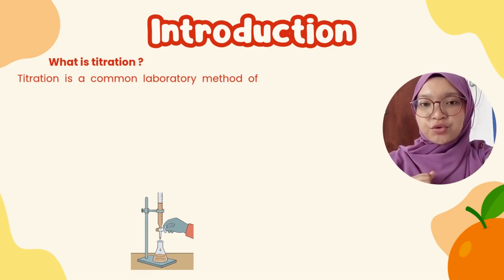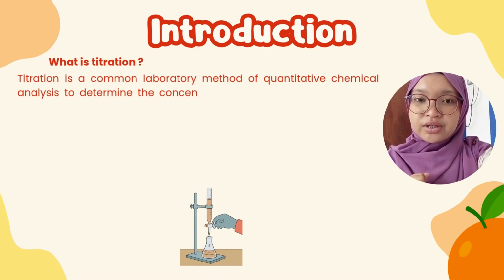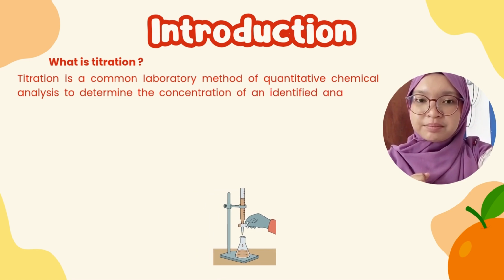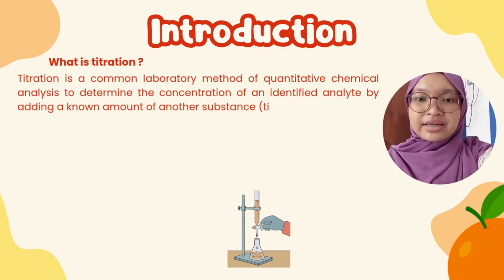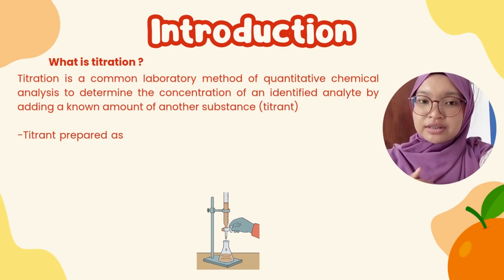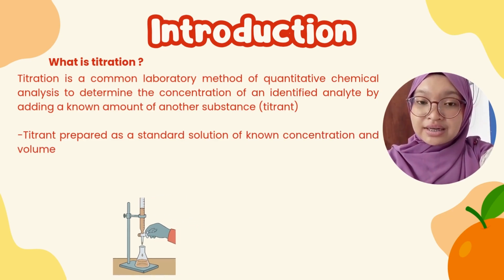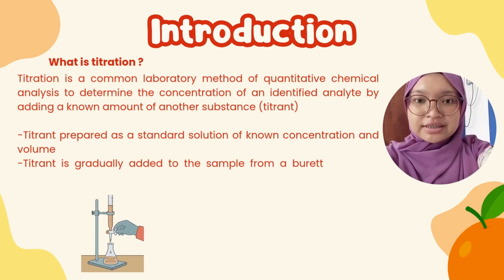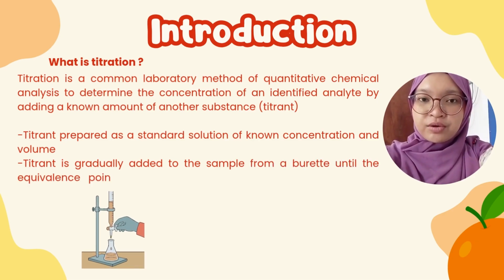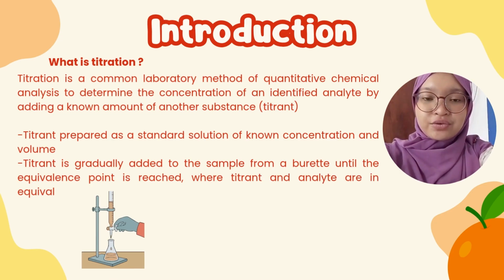First, I will explain to you about titration. Titration is a common laboratory method of quantitative chemical analysis to determine the concentration of an identified analyte by adding a known amount of another substance, which is the titrant. The titrant is prepared as a standard solution of known concentration and volume.